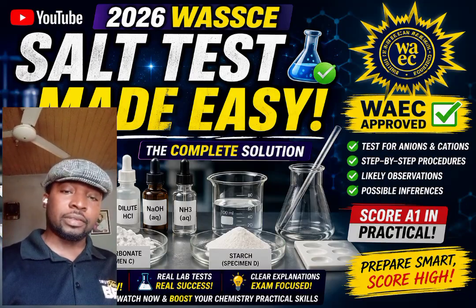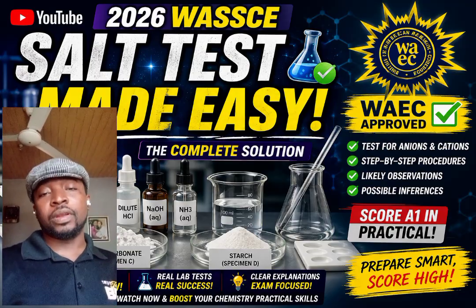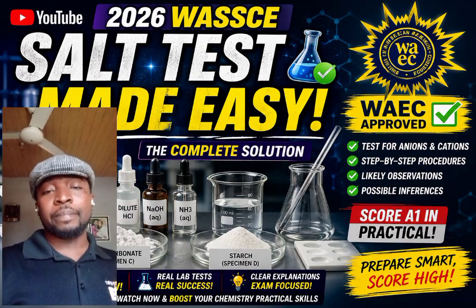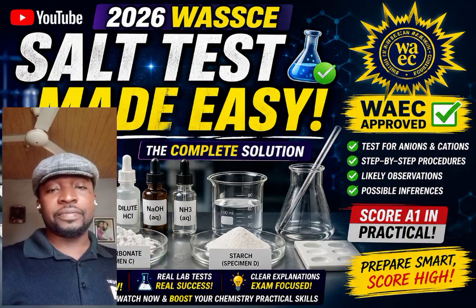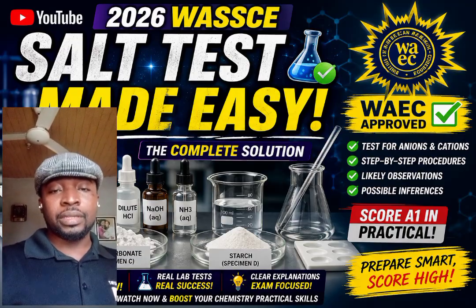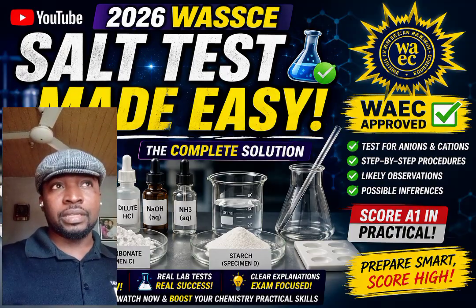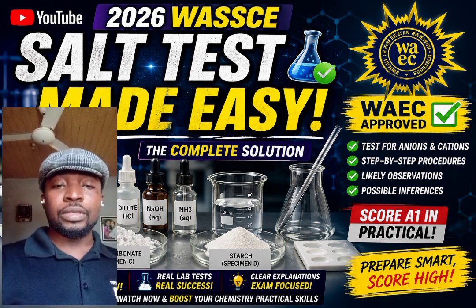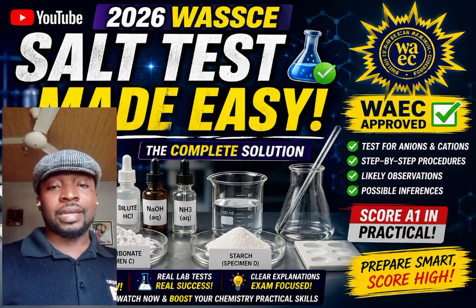Today we are going to be discussing qualitative analysis, or you can simply call it SALT test. Based on the samples or specimens provided, we have identified 3 different chemical species that we're analyzing in this forthcoming examination. One is lead-2 ion, the second one is trioxocarbonate 4 ion, and the third one is starch.